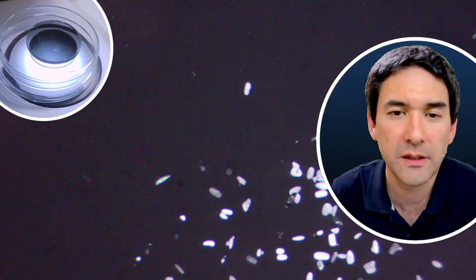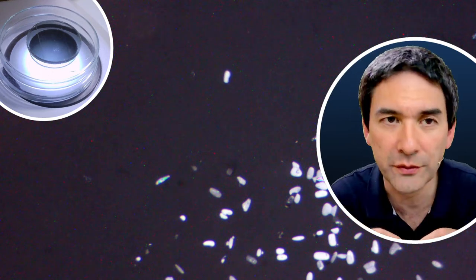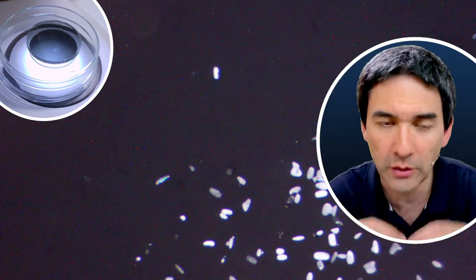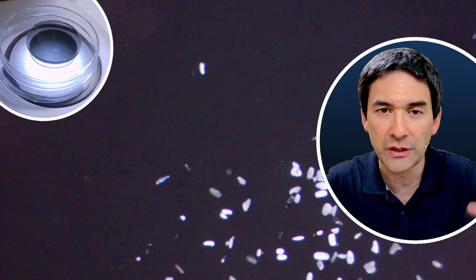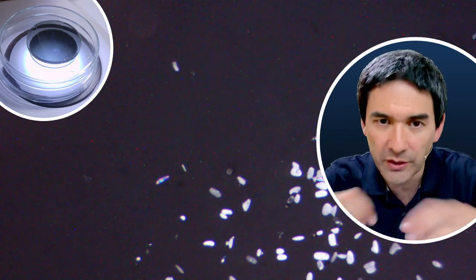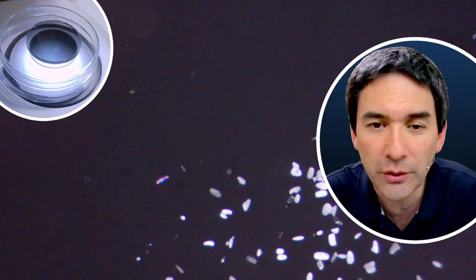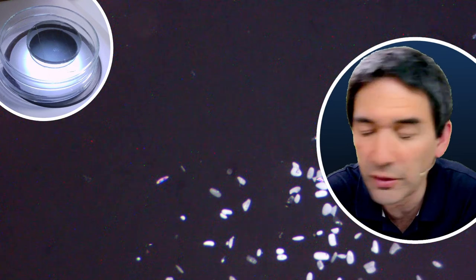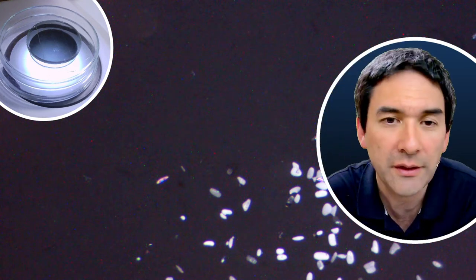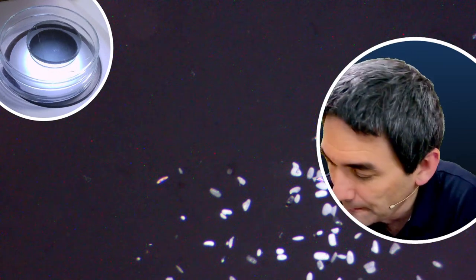And let's see how this actually works. Usually what happens is that because of the low surface tension of the alcohol, it will spread over the slide first, and then there's a larger surface area, the alcohol will evaporate, and then this is when the crystals start to grow again. You see now that the crystals are kind of round in shape, and the reason is because they already started to dissolve. They cannot dissolve further because the solution already seems to be quite saturated.